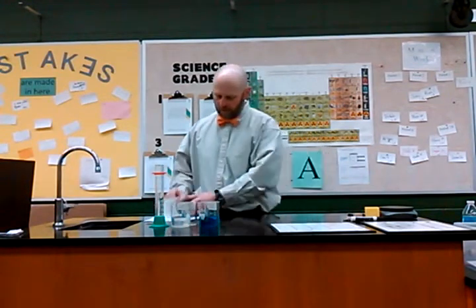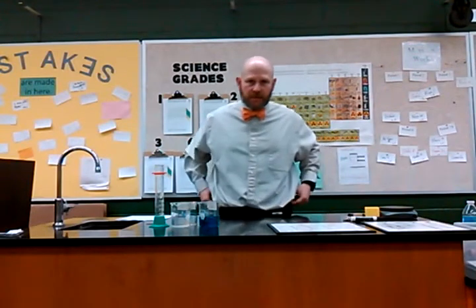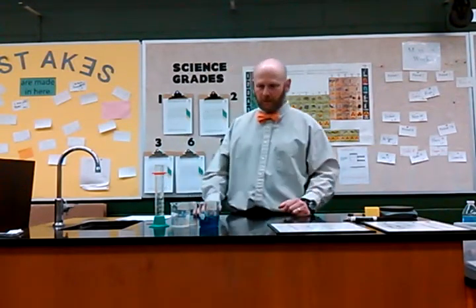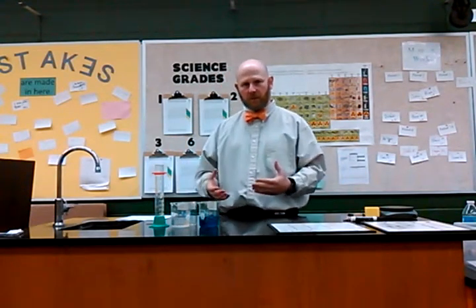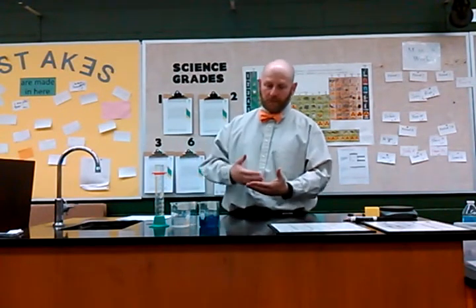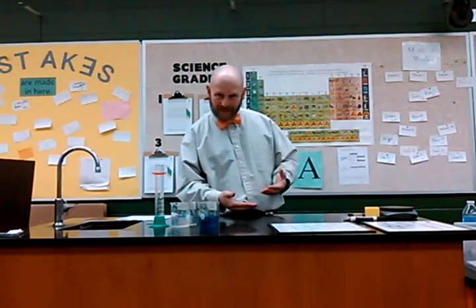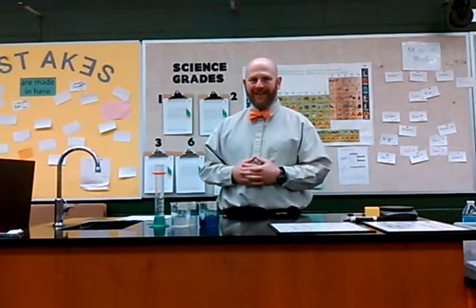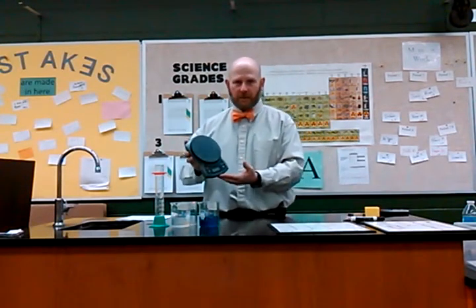Now, in today's experiment, we will be using several materials. In your lab report, you have to determine a hypothesis in the form of an if-then statement. For example, once we calculate the densities of some of these materials, you could say if material A was placed with material B, material A would rise or material B would sink, based upon its density. In today's experiment, we will be using a digital scale that measures to the nearest gram.